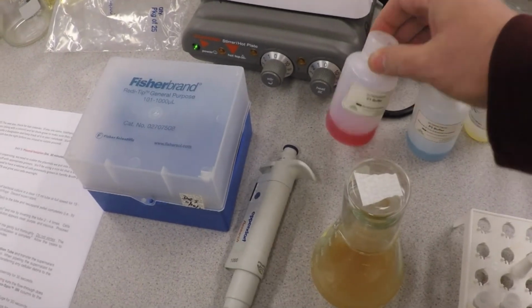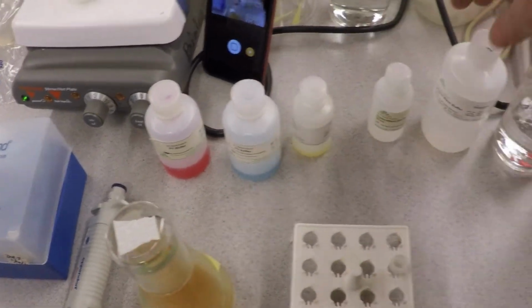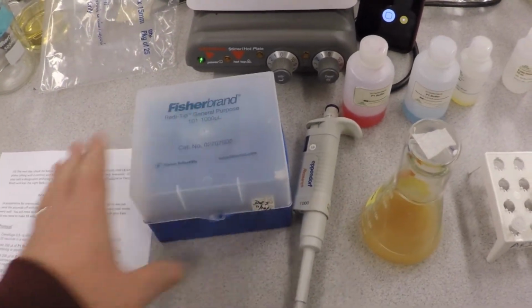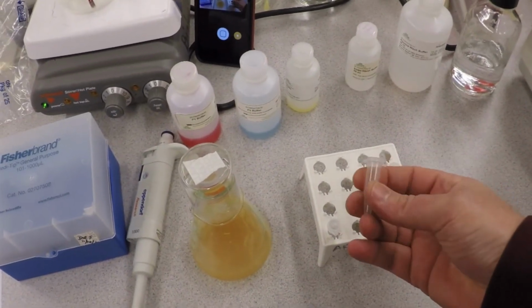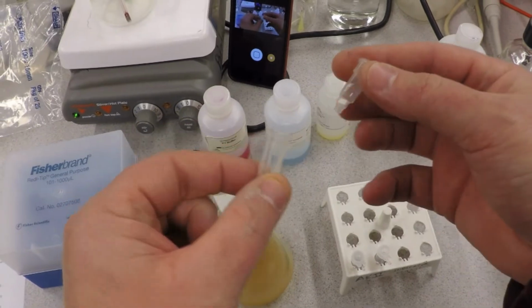These are different buffers that we're going to use for the actual plasmid prep. It's very easy, and so those will all be set up for you. You'll need a pipetteman, and then you'll need tips. You'll need a microfuge. You'll need an Eppendorf tube to pellet your cells, and then this is the magical stuff. This is what comes with the kit.